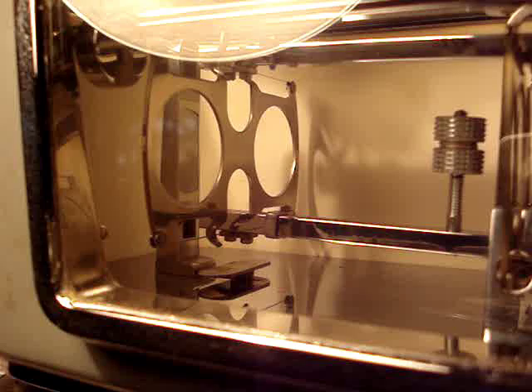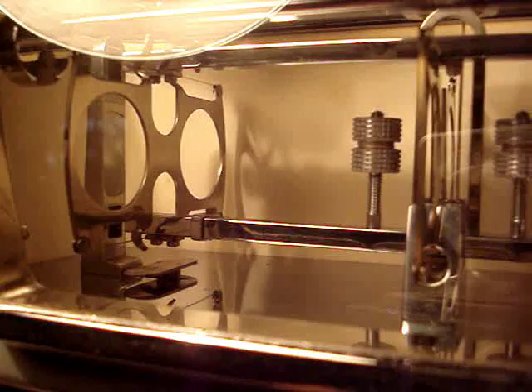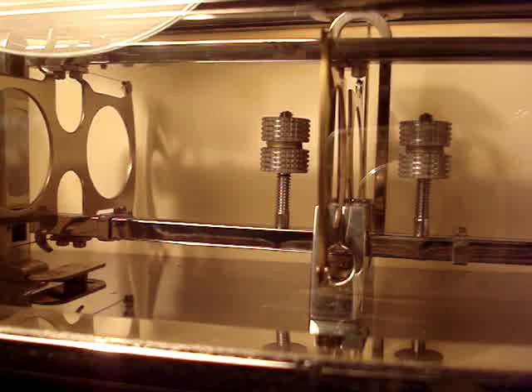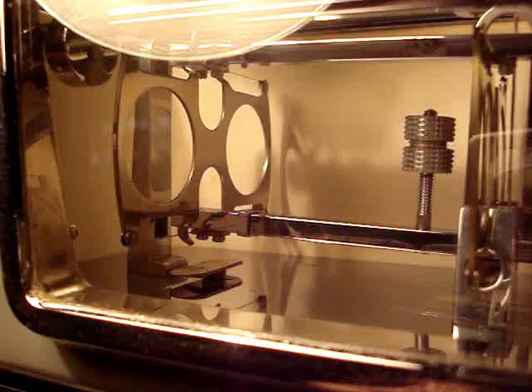This is a mechanical scale with a capacity of one gram. So that's the left interior part of the mechanism. There's the upper and lower horizontal beams with some adjusting screws. Maybe you can see the hair beams in there — there's six of them. Two in the center, two on the left, and two on the right. It's still in motion — I haven't touched the scale.